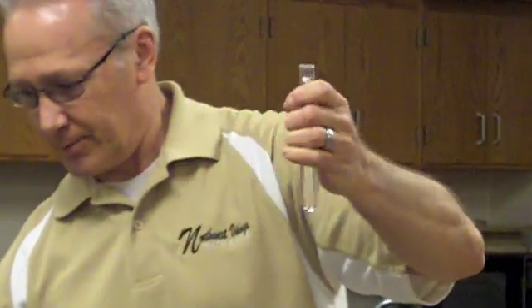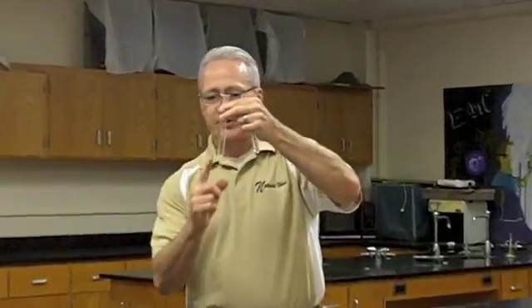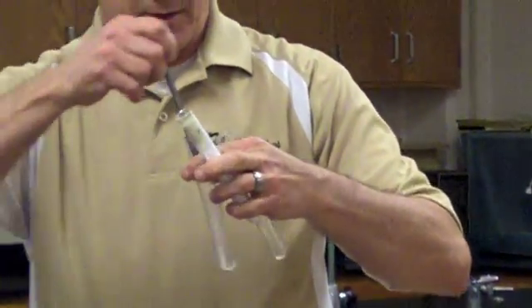That's the smaller test tube. Then it says to take the larger test tube, which is in the test packet there, and to fill the smaller end with a known carbonate. So I went to the knowns board and grabbed some potassium hydrogen carbonate, and I'm going to take a good size amount so that it fills the rounded end.